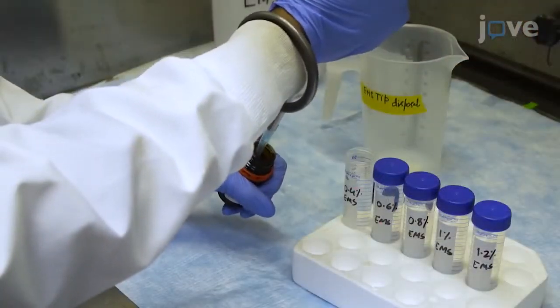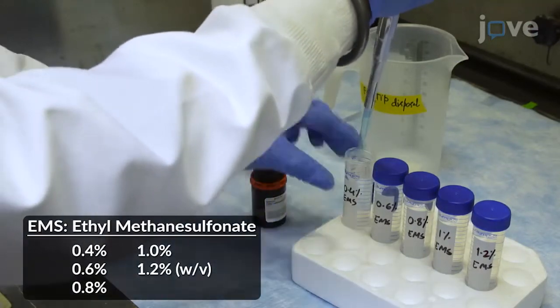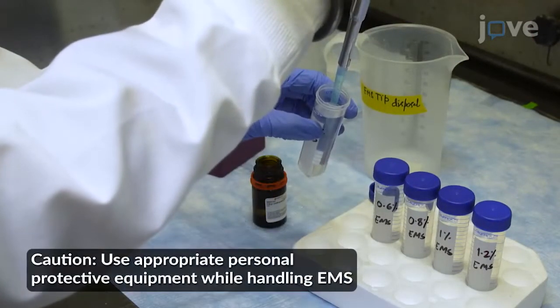Then, in a fume hood, prepare 50 milliliters of EMS solutions of 5 different concentrations by mixing EMS liquid in distilled water.